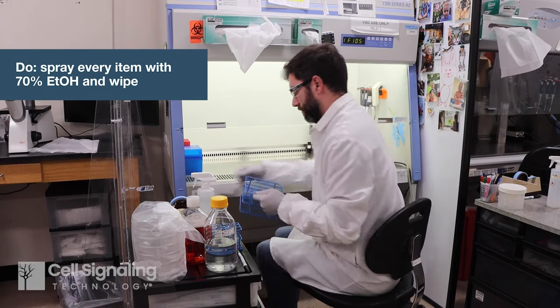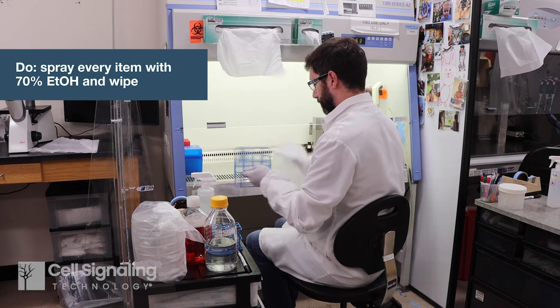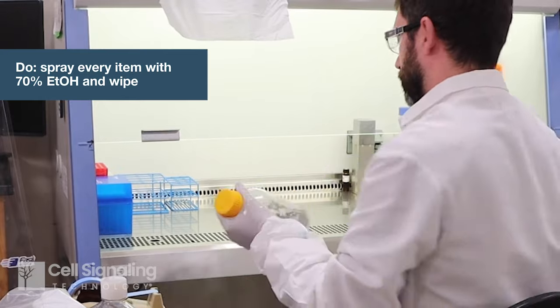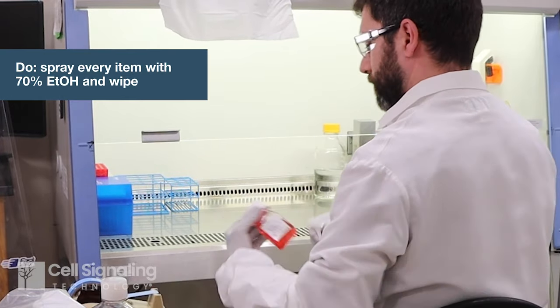Every time you place an item in the cabinet, you must also disinfect it by spraying with ethanol and wiping. This includes packaged consumables, media and reagent bottles — paying special attention to the cap and neck — and smaller conical and microtubes.